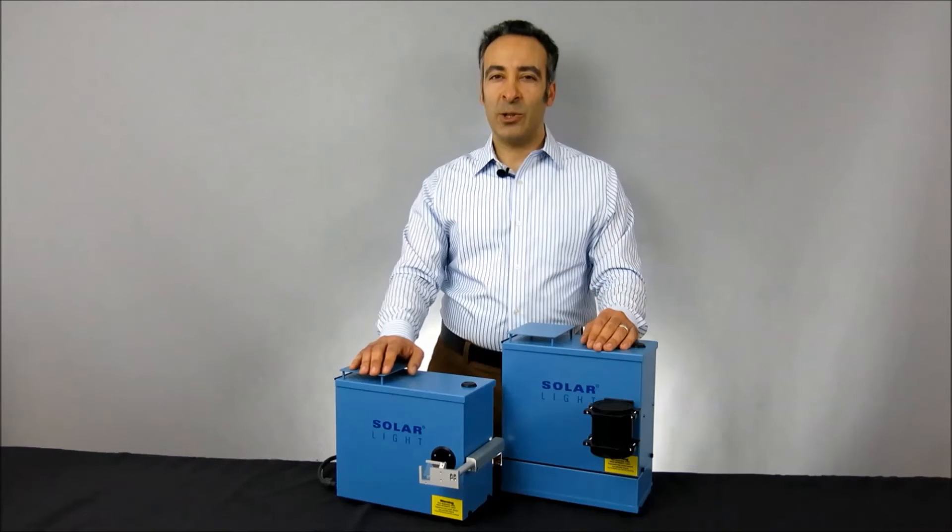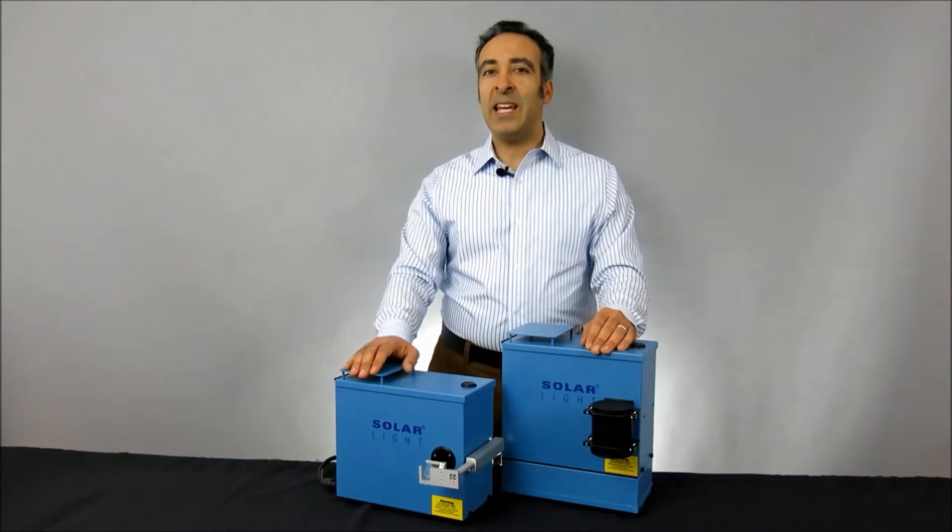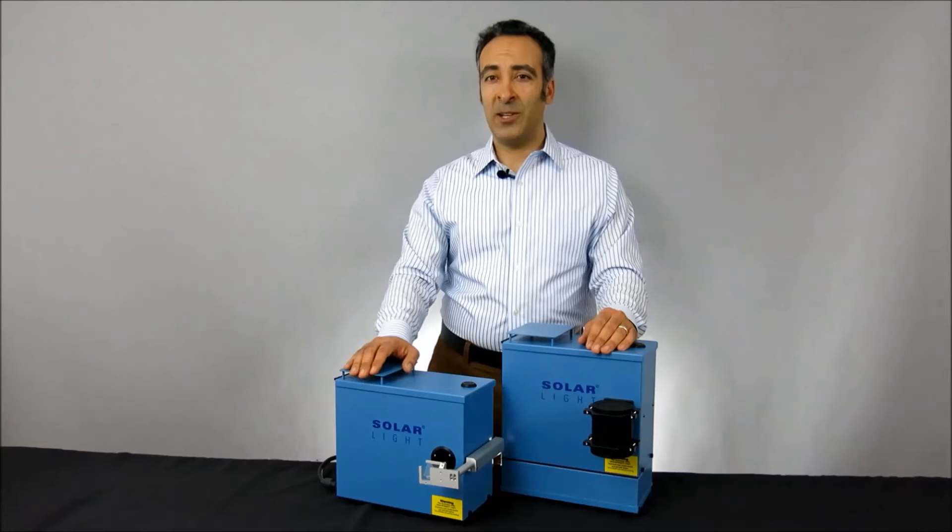The 16S-series solar simulators are available in both 150-watt and 300-watt variations, each using a premium-quality ozone-free xenon arc lamp to produce a 1-to-3 centimeter spot beam depending on the application.